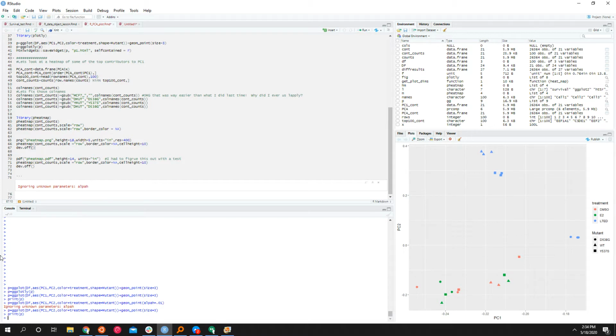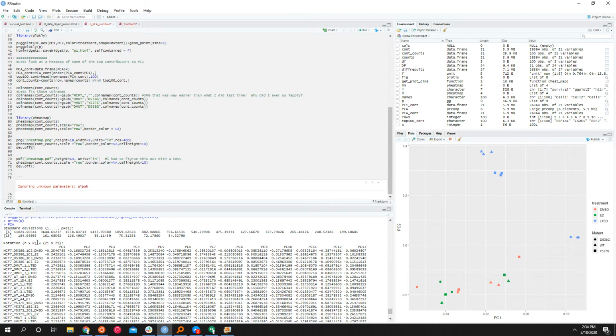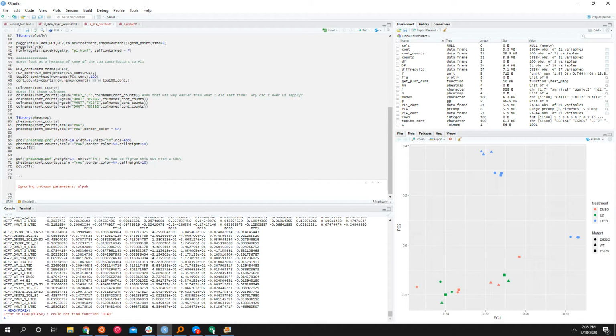So a fun fact that you may not have known is, here's our PCA object that we created from prcomp. It has a couple different attributes. You can find those by doing PCA$, and then if you hit tab, it'll bring up some of its attributes. We've been looking at rotation, but it also has center, it also has scale, and it has this value called x.